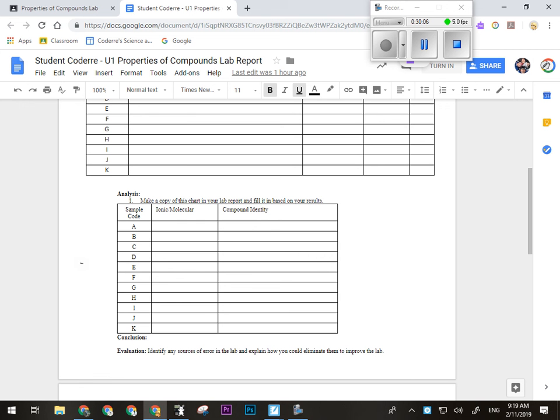Okay, just not sugar, because sugar is molecular and wouldn't have conducted electricity. So that's the process you've got to go through. You look at these properties and compare them to what you have and see if you can figure out which one's which. We also said the other day that certain metals like cobalt, copper, and nickel produce certain colors. So those would be things to look for as well.